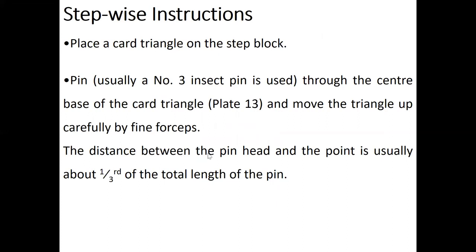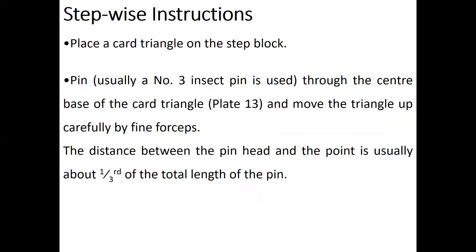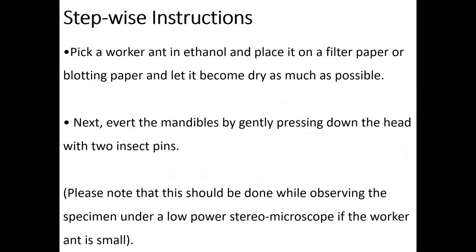The distance between the pin head and the point is usually about 1/3 of the total length of the pin. At the end of this presentation, you can watch a video, so that will give you more information.